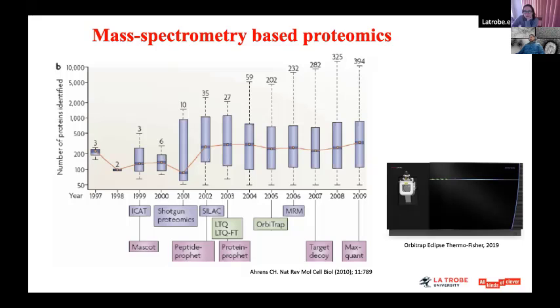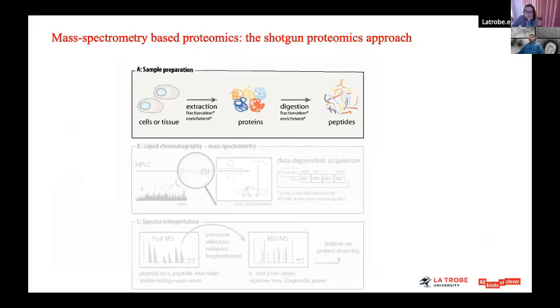So what is shotgun proteomics? And again, this is really a technology that every lab is using. So it's really important that you at least have the notion of understanding what shotgun proteomics is about. Shotgun proteomics is also called the bottom-up approach.